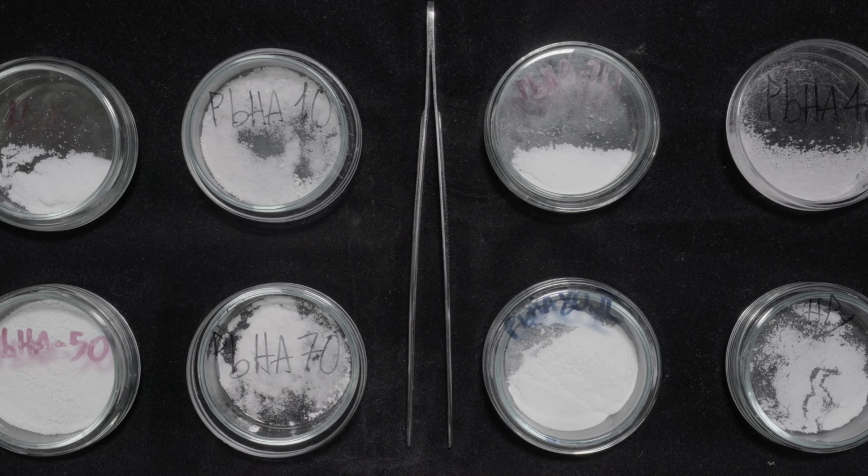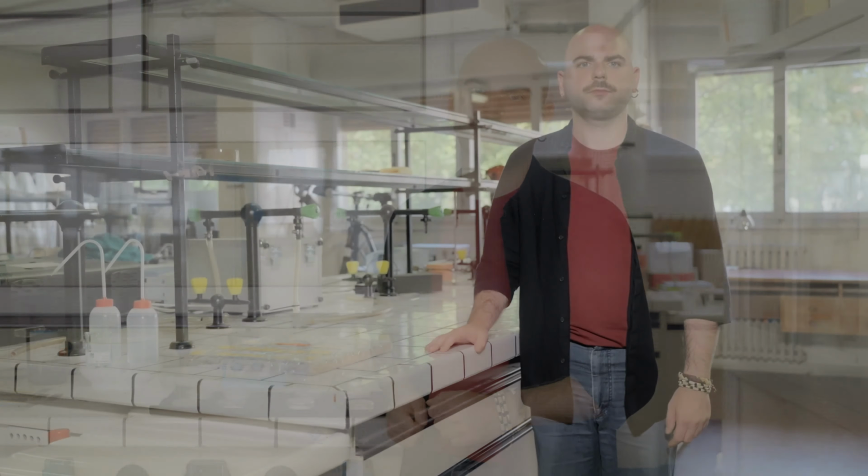The obtained database highlights how the increasing presence of lead inside the crystal produces some measurable changes in the structure parameters. This means that by measuring those parameters, we can identify which lead calcium phosphate compound is present in a sample.